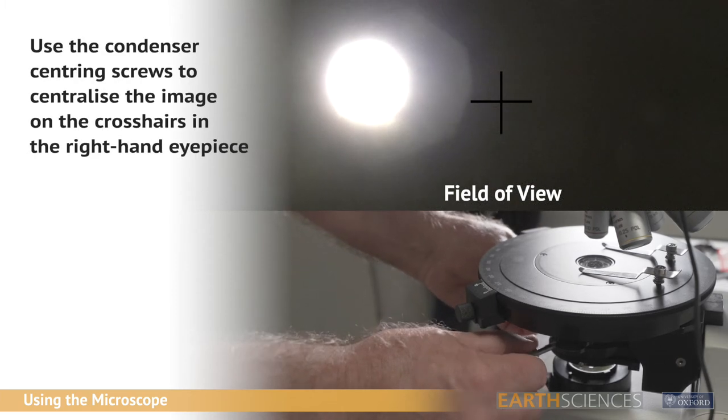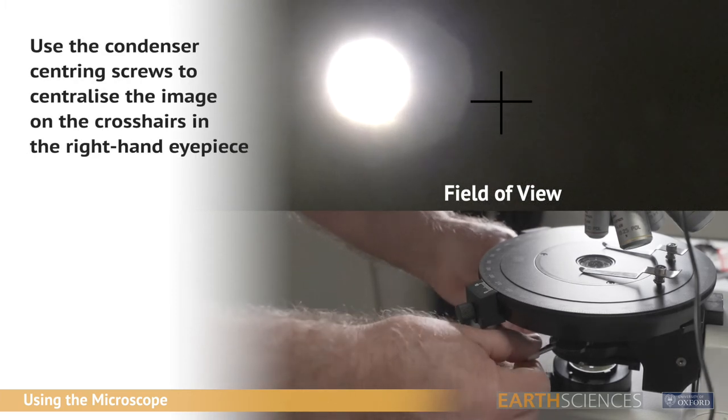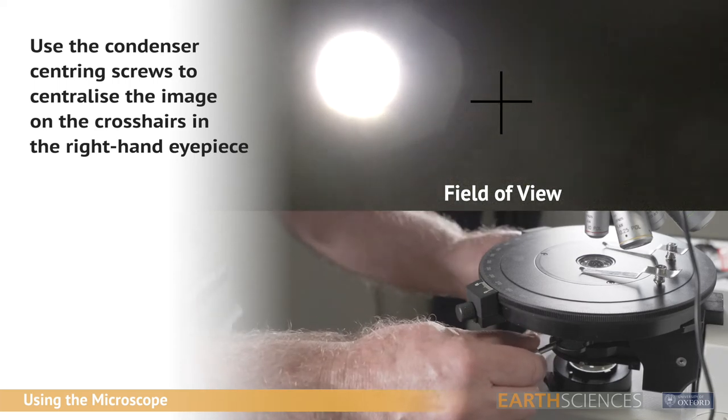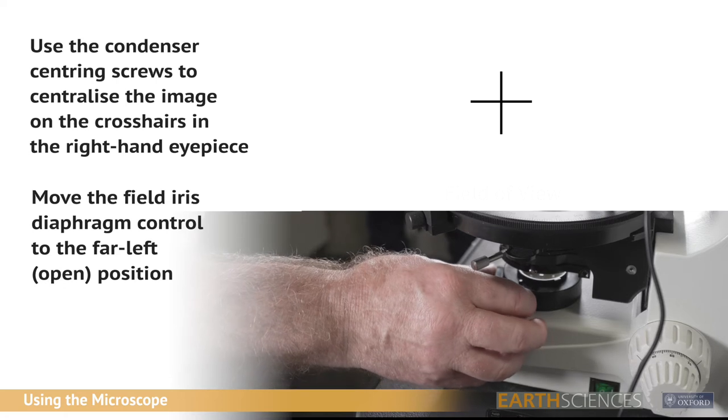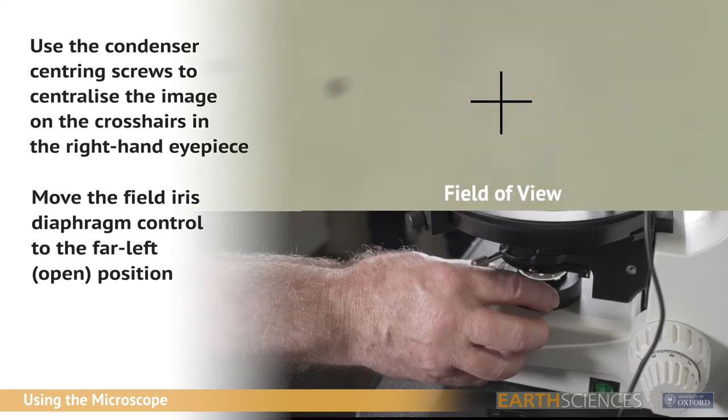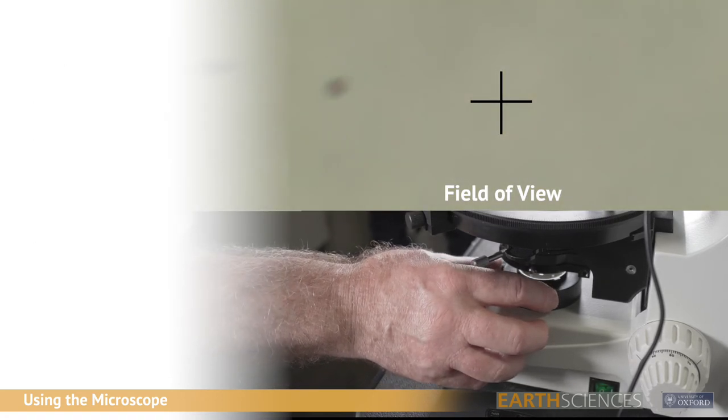Use the condenser centering screws to adjust the image until it's centred using the crosshairs in the right eyepiece. Move the field iris diaphragm control fully over to the left. The sub-stage condenser is now properly set up for use.